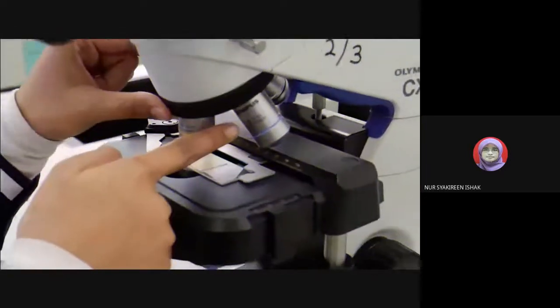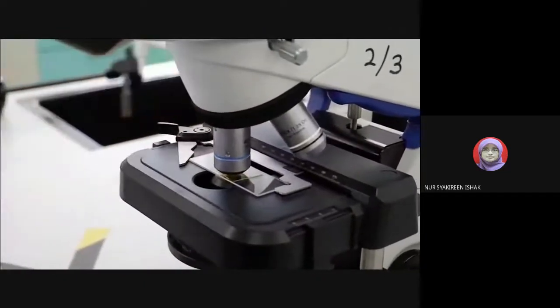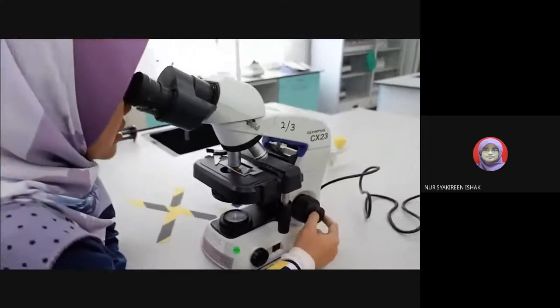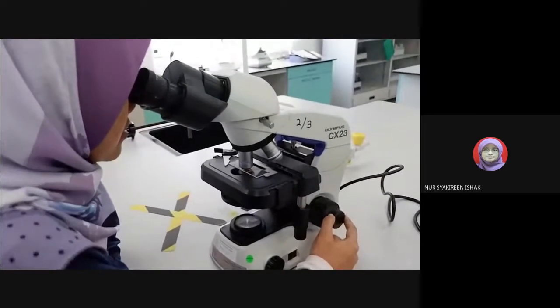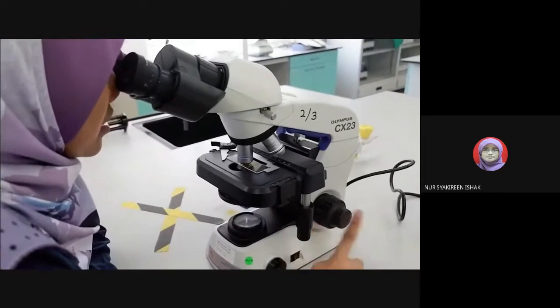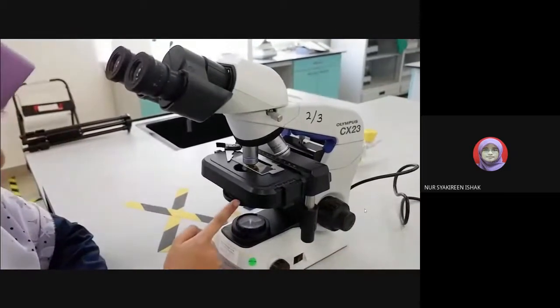You can use the stage knob to move the microscope stage so that the specimen is in the center of the field of view. Do the same with the 40 times magnification power of your objective lens. Please remember to only adjust the fine focus knob. Remember, you cannot adjust the coarse knob at this point.